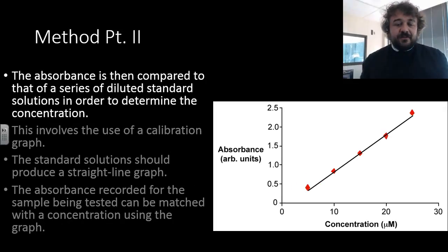So how do we measure that? First, we have a bunch of dilute standards, so we know the concentration exactly, and we run these samples through the AAS. This gives us a calibration curve, and you'll see that it's a straight line. It will curve at higher concentrations, even the calibration curve, because you get interference from each atom, as there are just too many of them around.